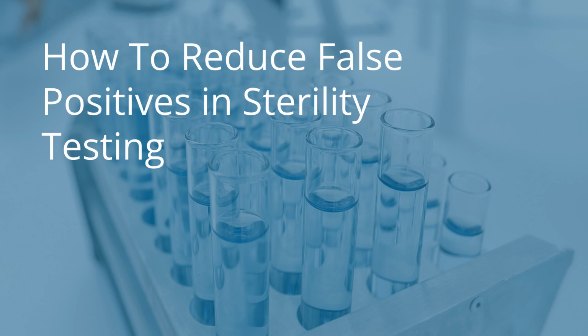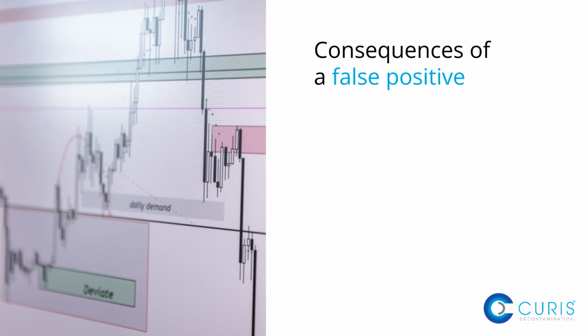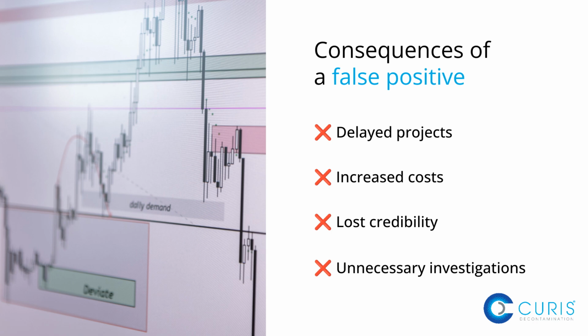Sterility testing is a critical safeguard across pharmaceutical, research, and clinical laboratories. It protects product integrity, ensures regulatory compliance, and ultimately safeguards public health. But when sterility testing produces false positives, the consequences can be significant. Delayed projects, increased costs, lost credibility, and unnecessary investigations.